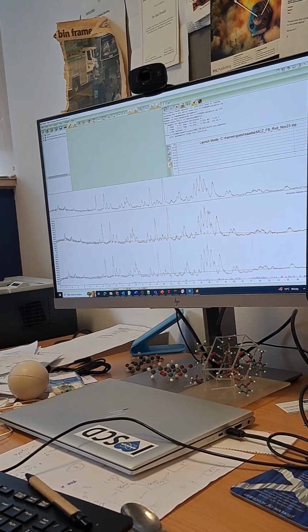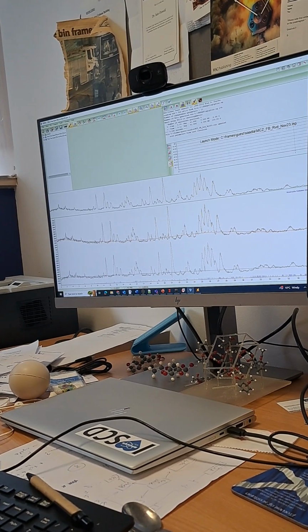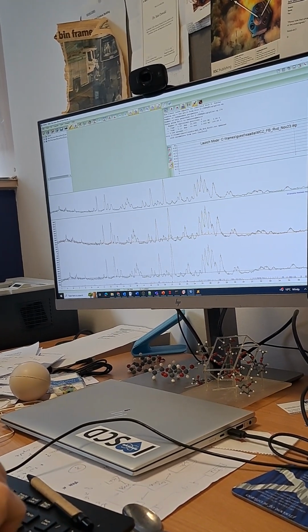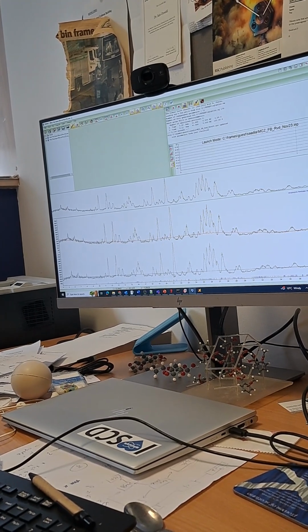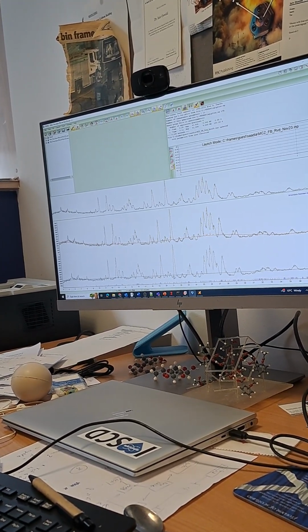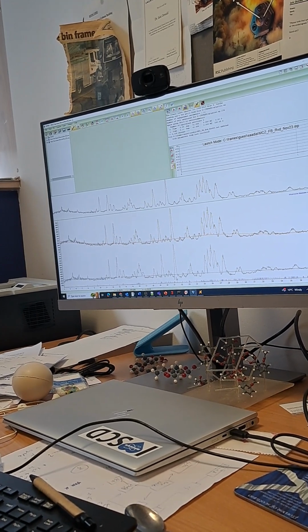But our intensities are all over the shop as well. You can see here that this is meant to be quite a strong one. We just need that over a little bit. In the difference curve, you can see we're going down and then back up. That's showing that we're not too far off.